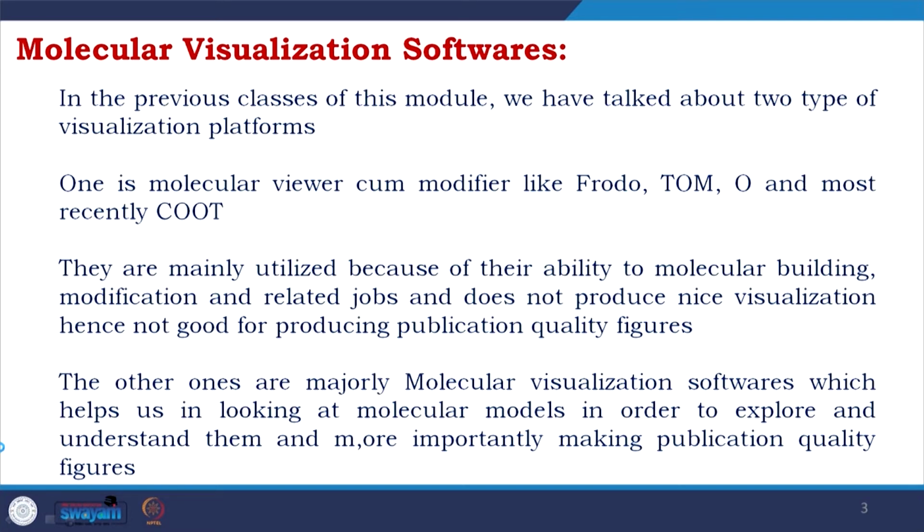One is molecular viewer cum modifier like Frodo, TOM, O, and most recently Coot, which I talked about in detail and demonstrated. But these softwares are mainly utilized because of their ability for molecular building, modification and related jobs, and do not produce nice visualization, hence not good for producing publication quality figures.